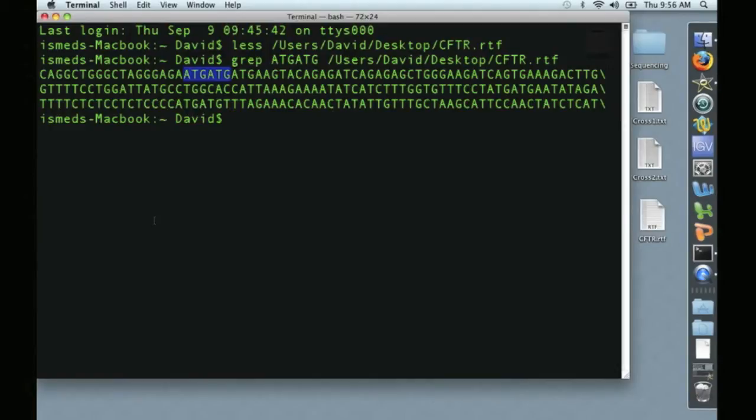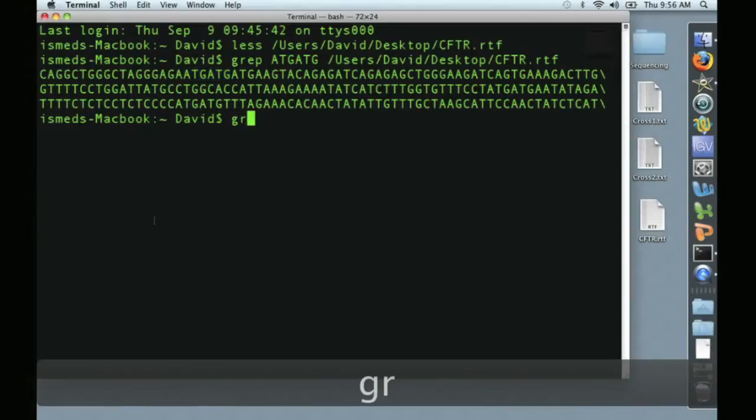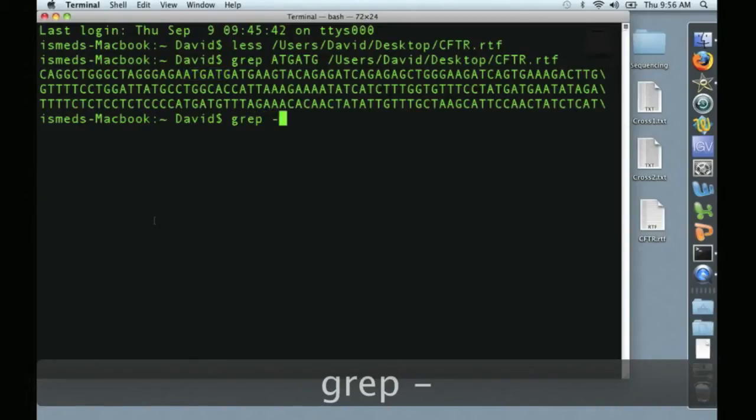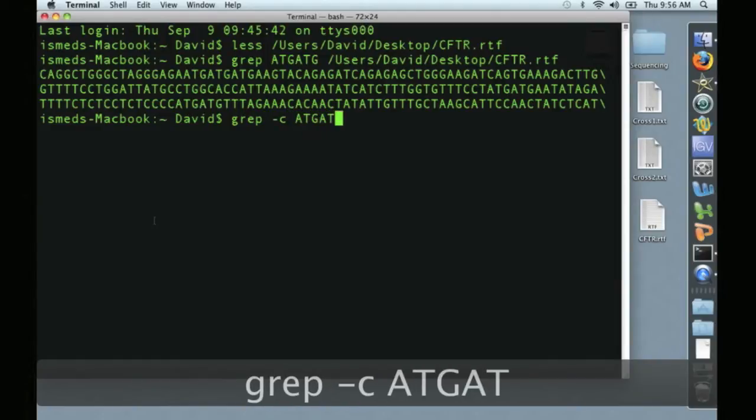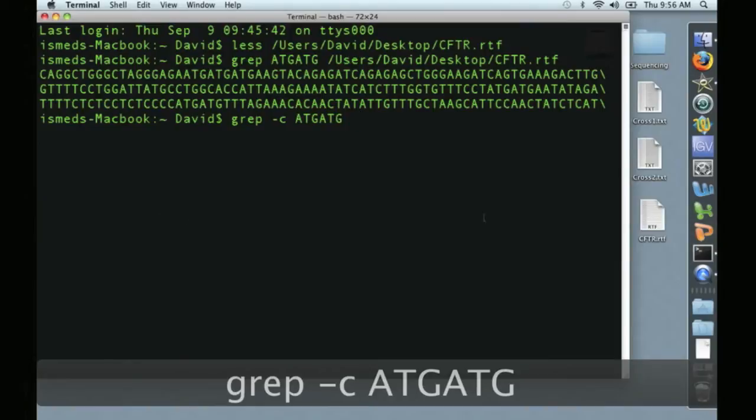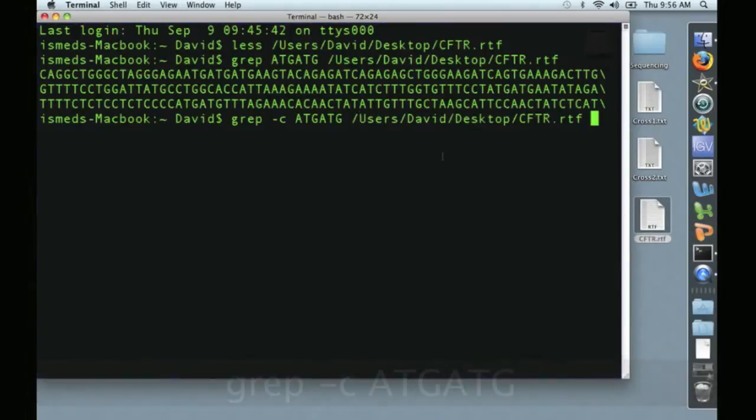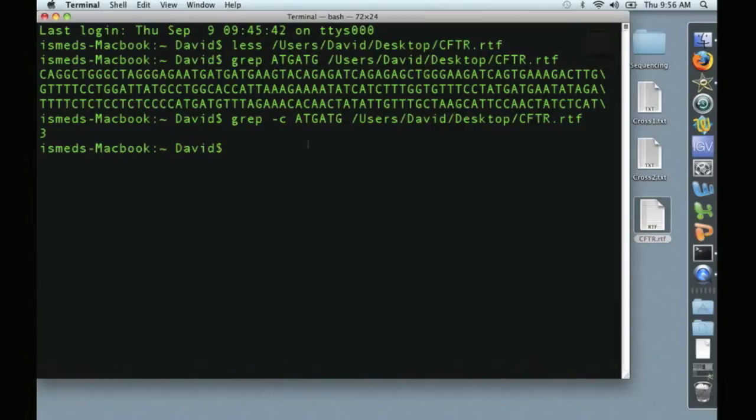The next thing we want to use GREP for is to count something within a sequence file. So using the example from before, we'll type GREP -C, which stands for count, A-T-G A-T-G, and then again we'll drag and drop the file name. And this tells us that the repeat ATG ATG occurs three times within the sequence, which we already knew from here.